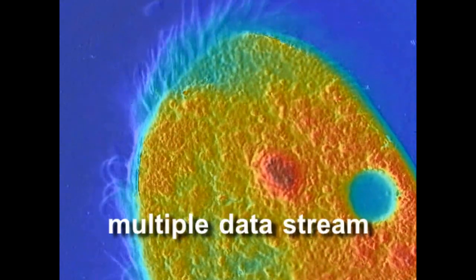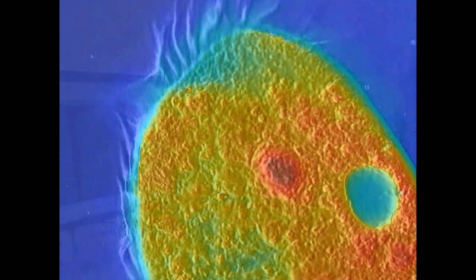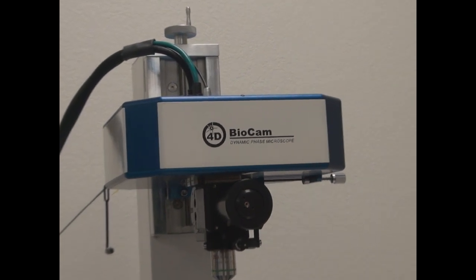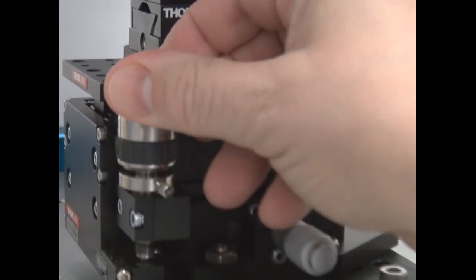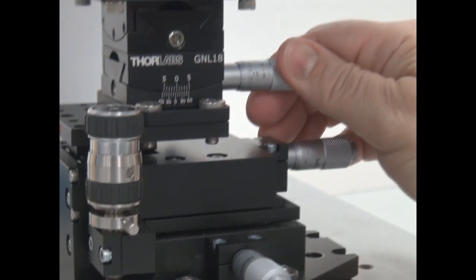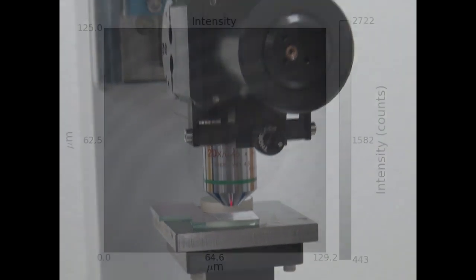What we've done is take that technology for the phase cam and apply it to a phase measuring microscope using a Linnik objective, and we can adjust the path length, the tilt of the sample, and the focus to be able to get a nice phase measure.